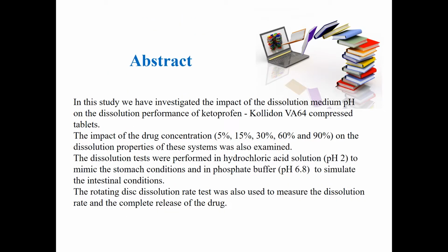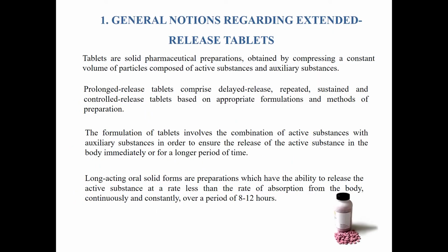In this study, we have investigated the impact of the dissolution medium pH on the dissolution performance of ketoprofen compressed tablets. The dissolution tests were performed in hydrochloric acid solution to mimic the stomach condition and in phosphate buffer to simulate the intestinal condition. The impact of the drug concentration on the dissolution properties of these systems was also examined.